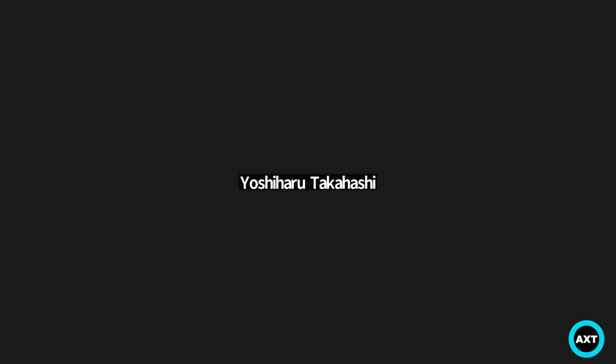Another question is, do the lasers in the system require any kind of maintenance? Are these flash lamp based lasers? Yes, it is necessary to tune the laser at least once a year. But there's no ongoing maintenance of the lasers otherwise.